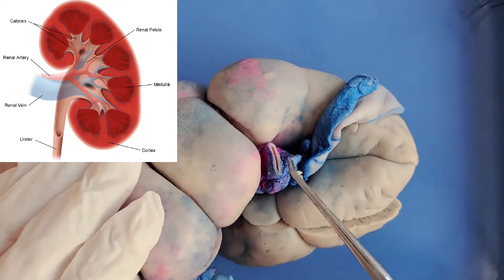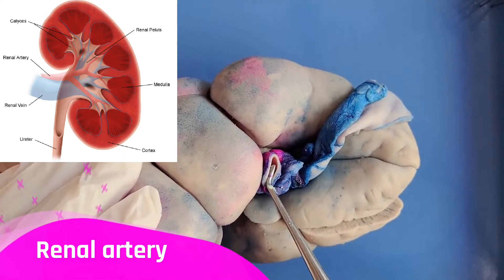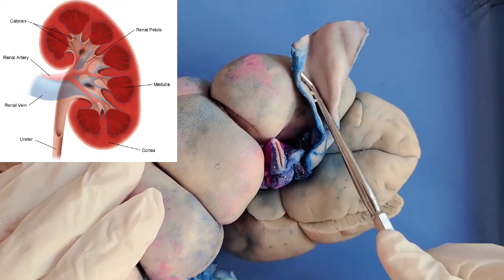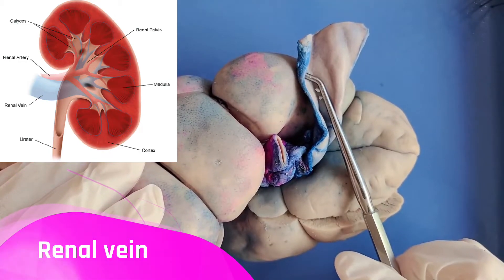Now looking at the other two structures: the thicker one is the renal artery, which takes blood into the kidney, and the thinner one — which has been cut open — is the renal vein, which carries blood out of the kidney.